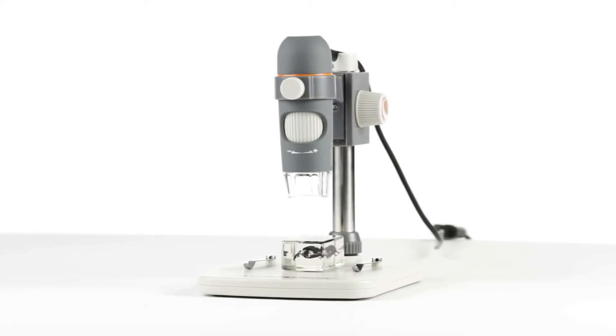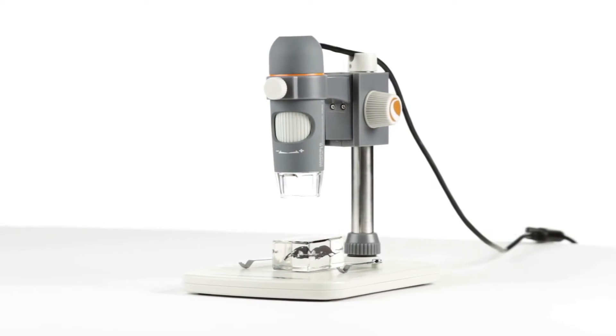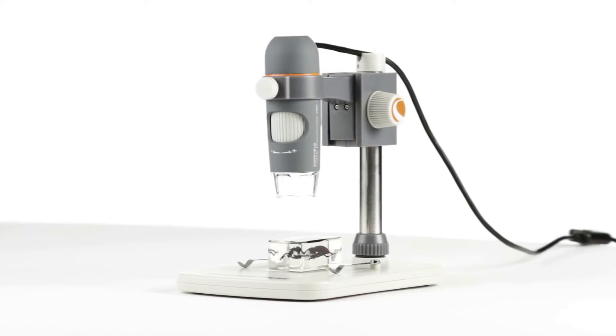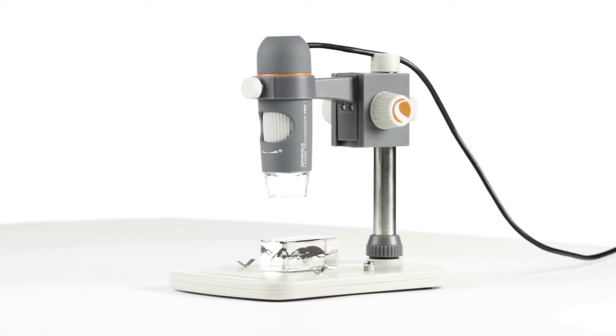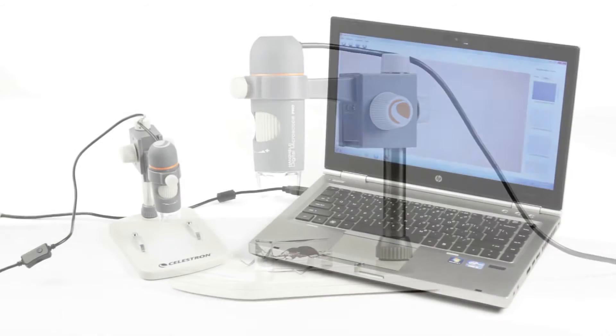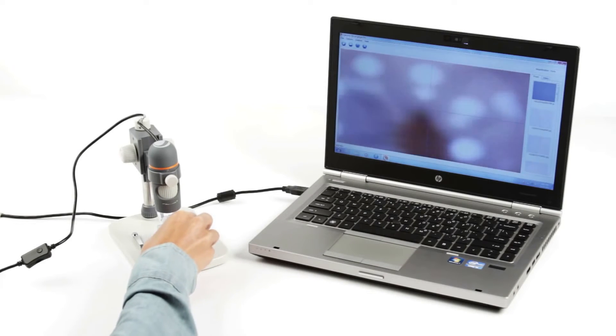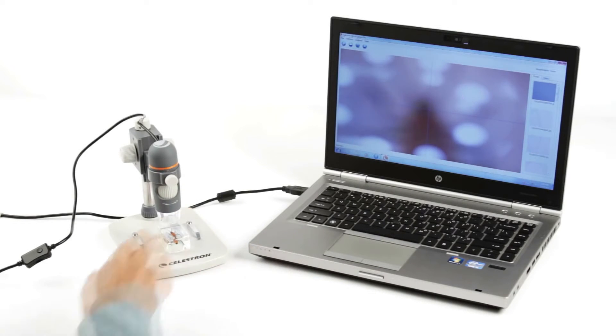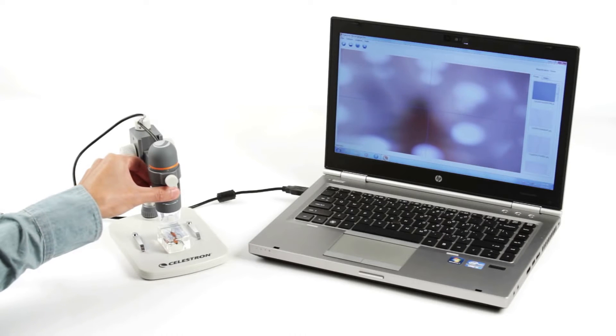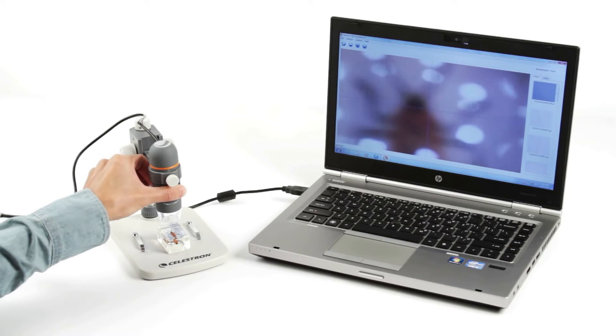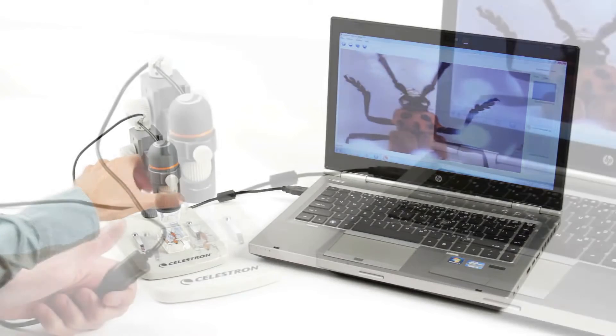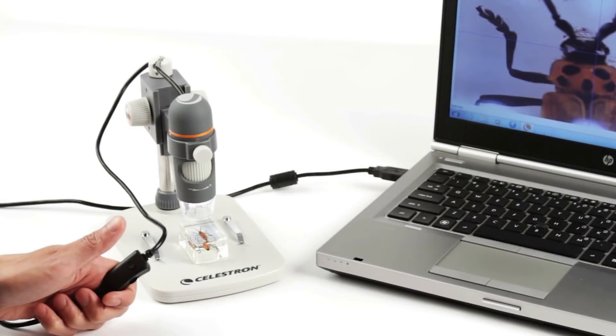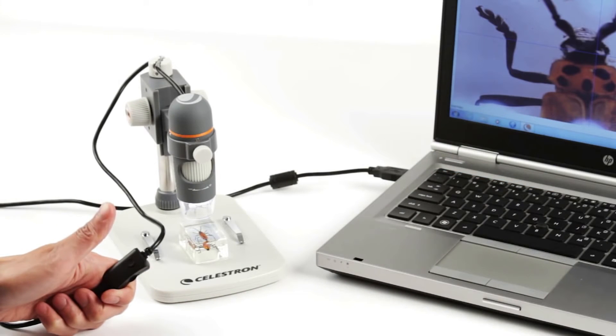Get Celestron's best viewing experience for your 3D specimens with the 5-megapixel USB-powered handheld digital microscope Pro. With this microscope's precision, five-element infrared-reducing glass lens and true 5-megapixel imaging sensor, specimens like minerals, insects, stamps, circuit boards, and more come into sharp focus on your laptop or desktop computer.